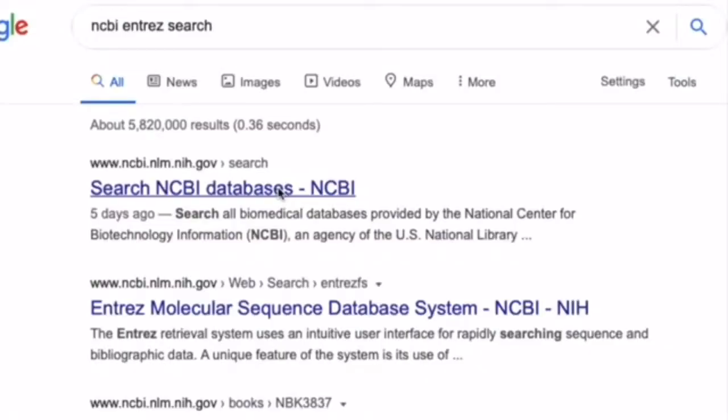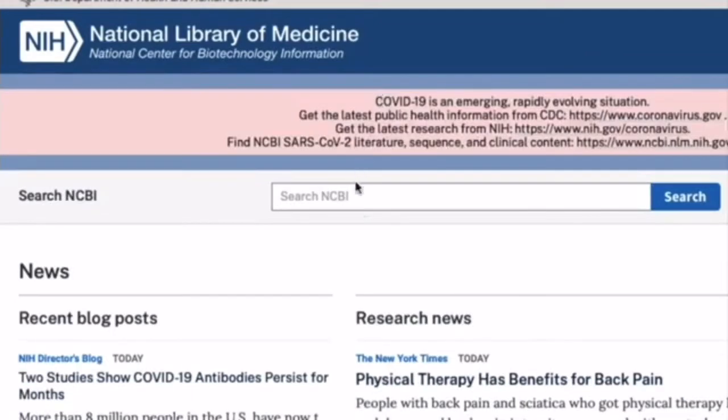Now let's step it right back. Where do you get the primers to design for this real-time PCR you wish to do? You can obtain the sequence of the gene of interest via sites such as the National Center for Biotechnology Information. And once you have this sequence, you can identify the region you wish to amplify.